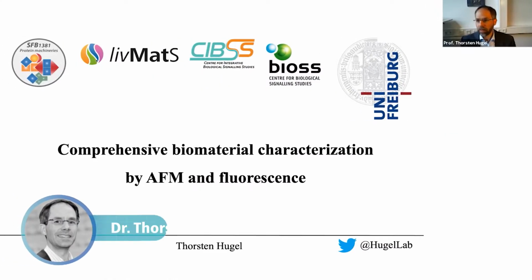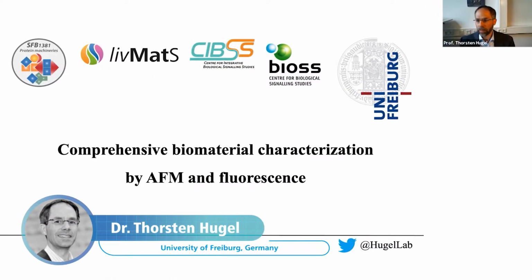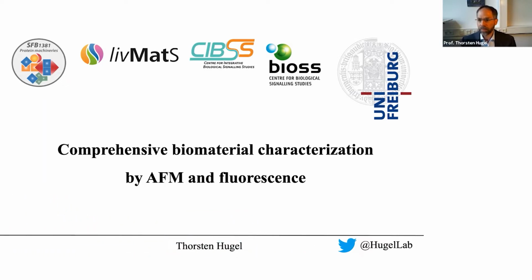I was really impressed by the many materials and also techniques that were shown during the last 2.5 days. And I'm really sure that the future of the AFM looks very bright. So what I would add to this is 2 examples from our group where we show how AFM and fluorescence can be used to tackle maybe some additional challenges.